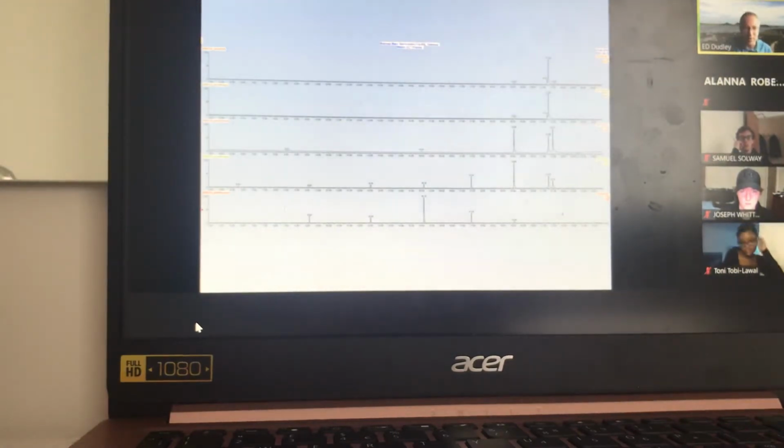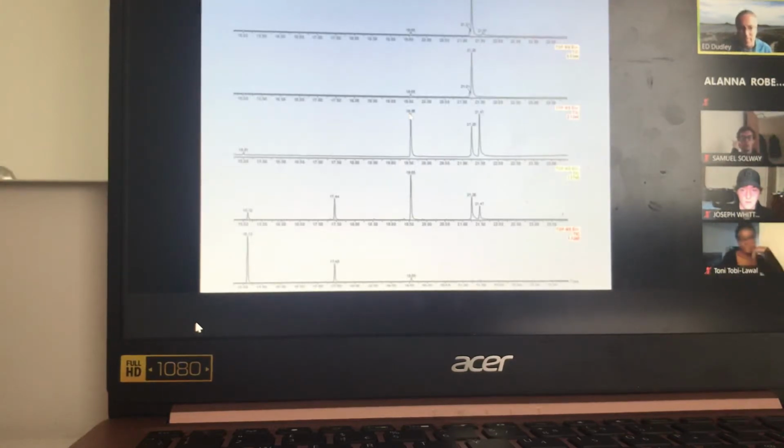So this is our data. You've got a few peaks, and there's a few peaks on this end, and these are 5 different samples. These two look quite similar to each other. These look similar here, but this one's got more peaks here, and this one's got a lot of peaks on this end, but nothing much up here. And each of these peaks has a specific retention time. So 19.5, 17.4, 21.2. And so I've generated for you the peak area, 5 replicate extractions of each sample.